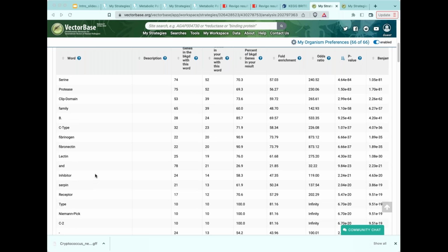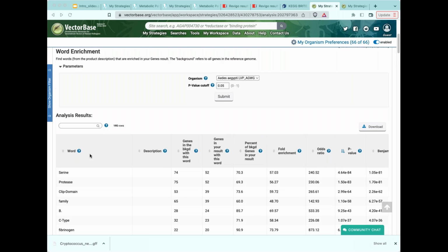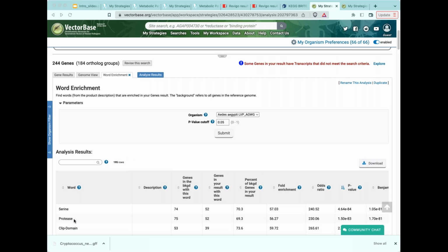And this is sometimes particularly useful if you know that you're working with a set of genes for which there's not very much information available, whether they have not been annotated or they're just an unspecified, unstudied set of genes. But they may sometimes have product description information. So this is one way to visualize this data really quickly and take a glimpse at what actually is in your sample, in addition to running GO enrichment or metabolic enrichment analysis if you like.